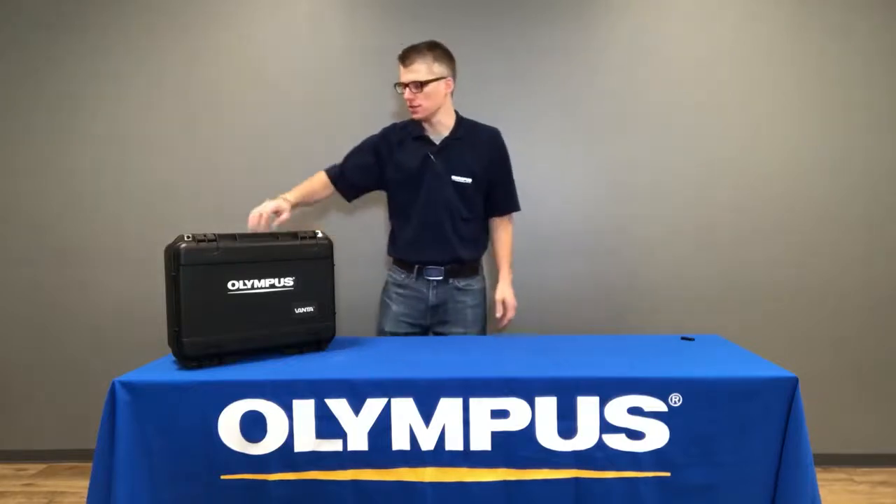Hi, I'm Michael Hall, one of the X-ray specialists here at Olympus. Thank you for choosing Olympus for your XRF needs. I want to show you today what comes in your Vanta kit.